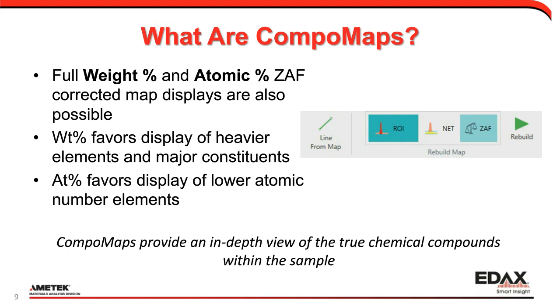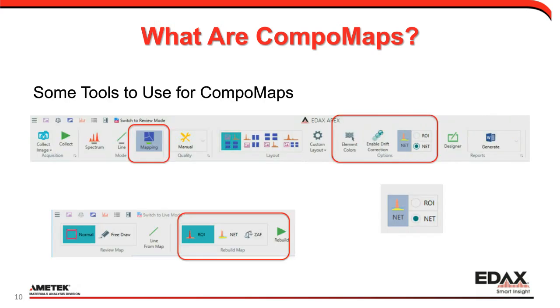They are an in-depth display of the true chemical compound of our elements and our materials within the sample. Each pixel displays a wealth of information. So here are some tools for how to use CompoMaps.